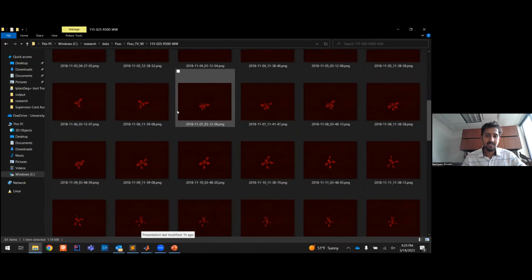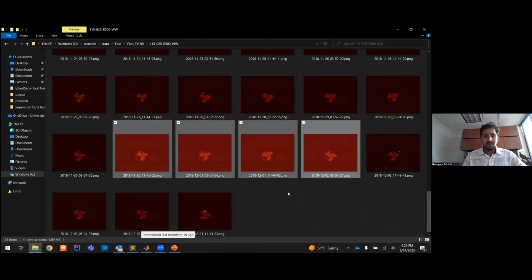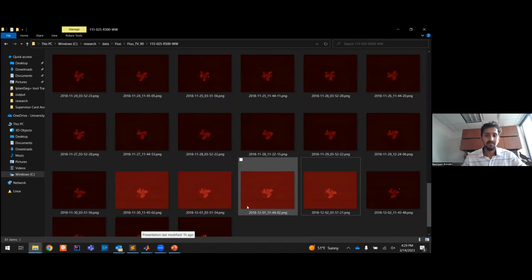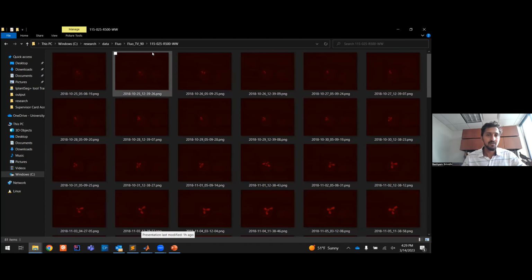So that was the data set: a big data set, many plants, and tricky images. On those 4 days the camera didn't perform very well, and we had these intermediate things which made it difficult to have one mode of operation. We couldn't just do it in one go, so we needed some flexibility on every image or on some images. That made this tool really helpful.